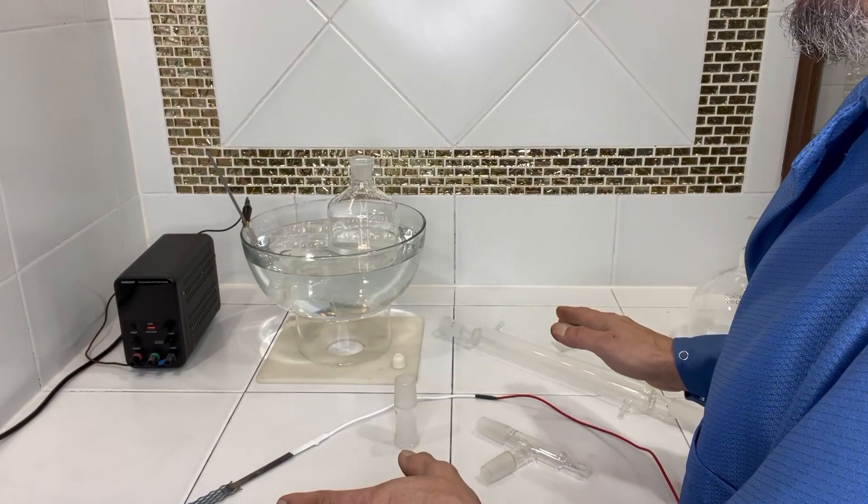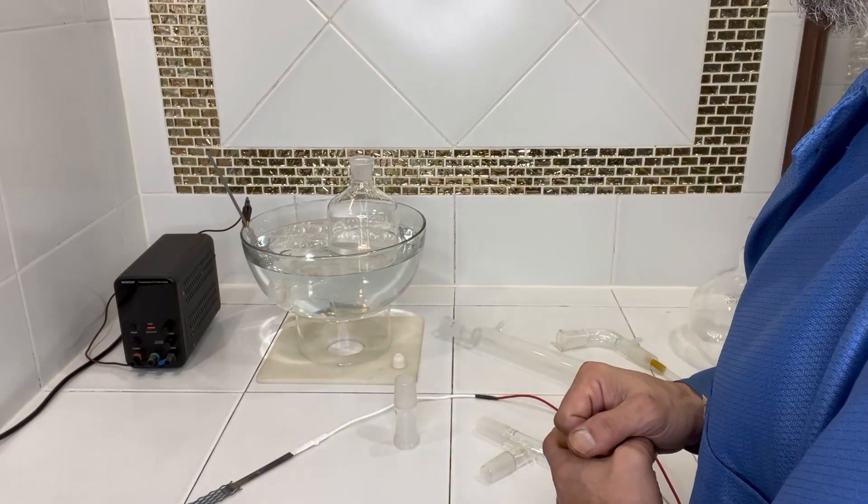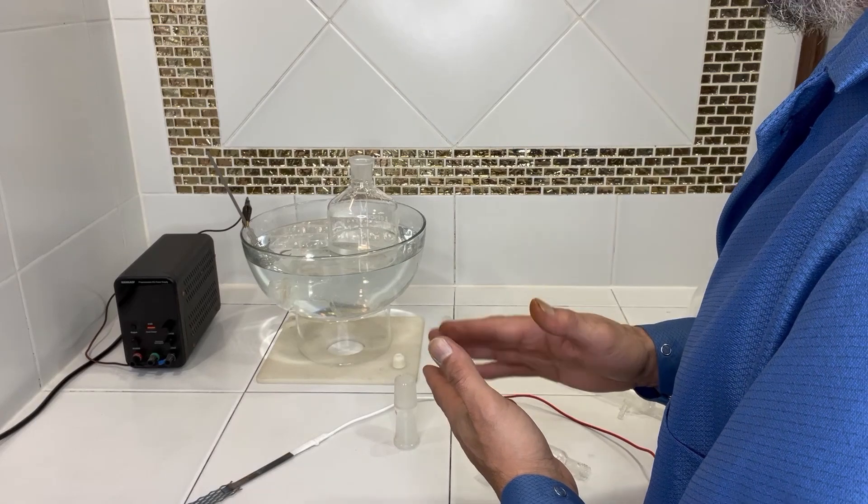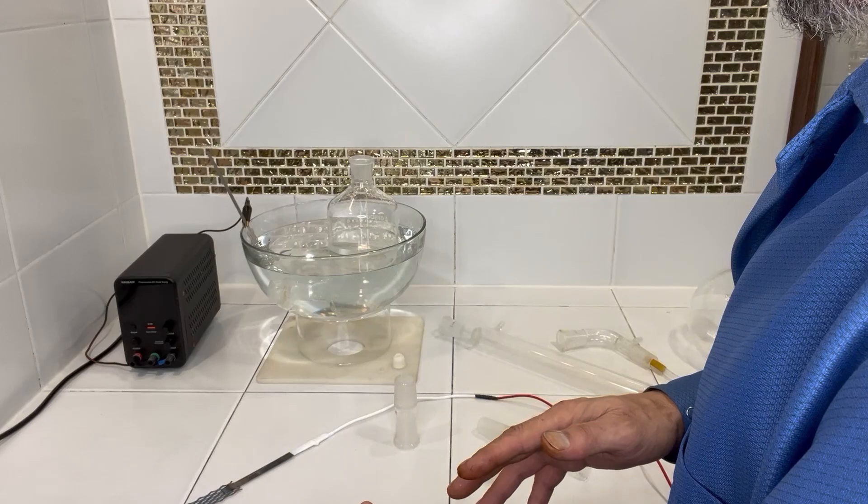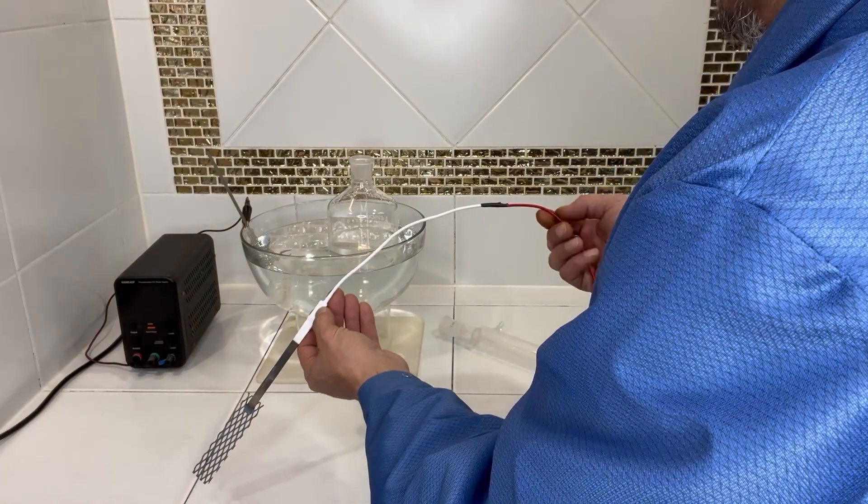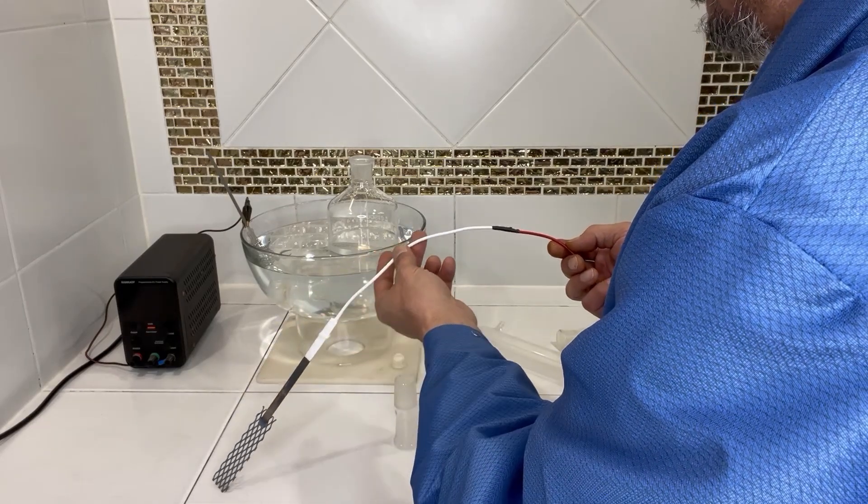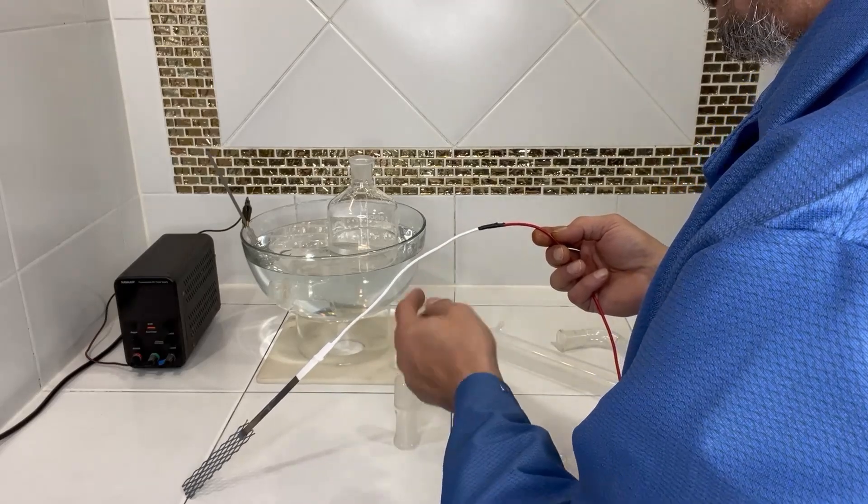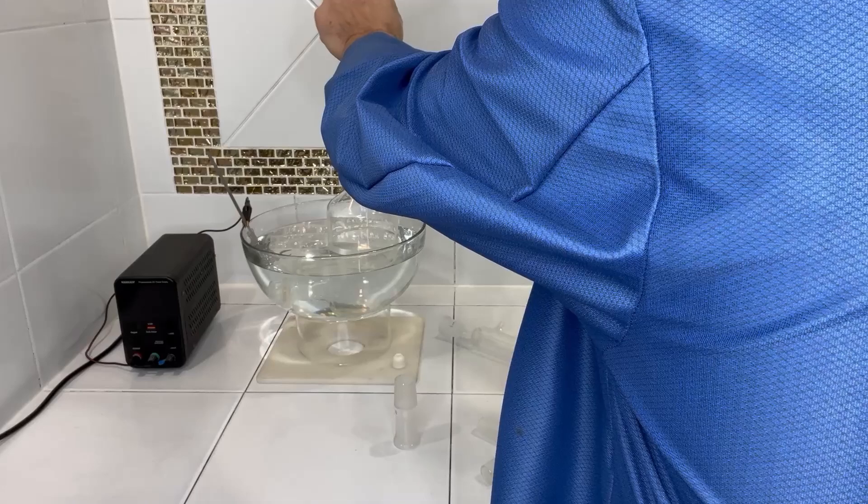Now depending on what type of reaction you're looking for, you can use different types of cathodes and anodes, nickel, aluminum, lead, depending on what type of reaction. Now for this reaction, we want to make sodium hydroxide and chlorine. So what I've done is attach an electrical wire to my anode and I've wrapped this in PTFE tape, Teflon tape. So the chlorine gas doesn't permeate this wire and we'll go ahead and lower that down into the aspirator bottle.